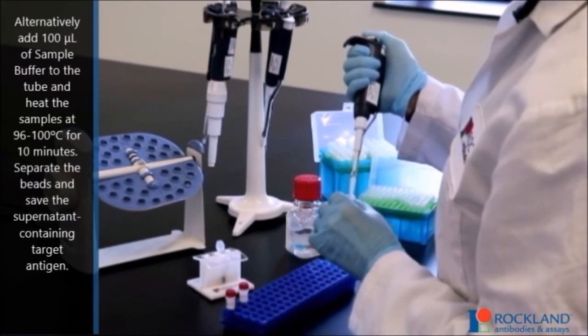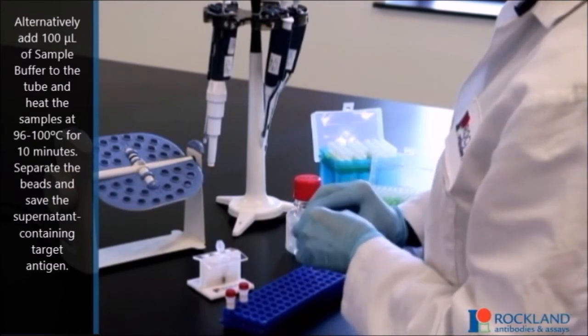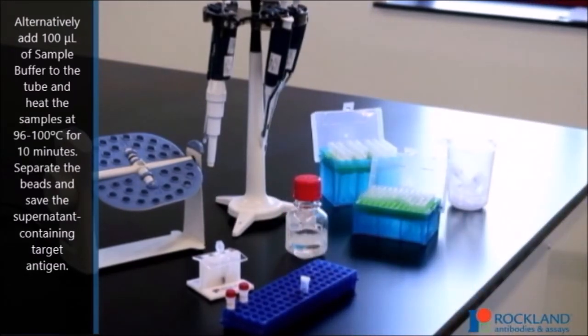Alternatively, add 100 microliters of sample buffer to the tube and heat the samples at 96 to 100 degrees Celsius for 10 minutes. Separate the beads and save the supernatant containing the target antigen.